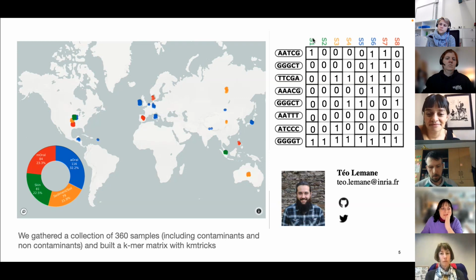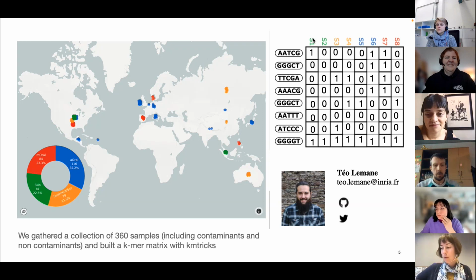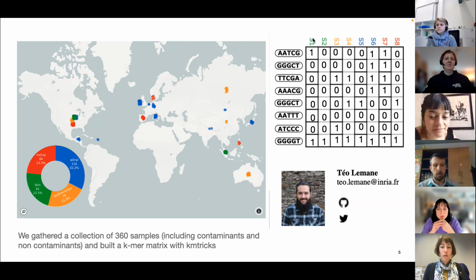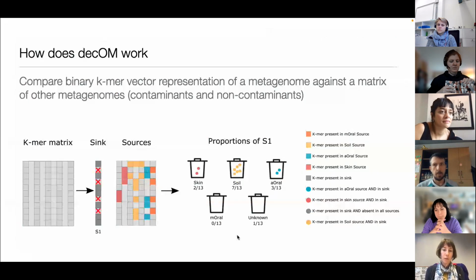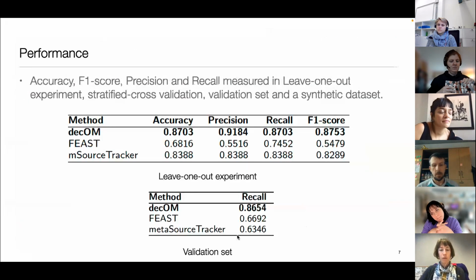Any other question? I have another one about the k-mer Bloom filter then. So for the reads that come from really highly conserved regions of the genome, how do those end up being treated? Is there a way that you can distinguish whether those are genuinely from an ancient sample or an ancient organism versus modern contamination?